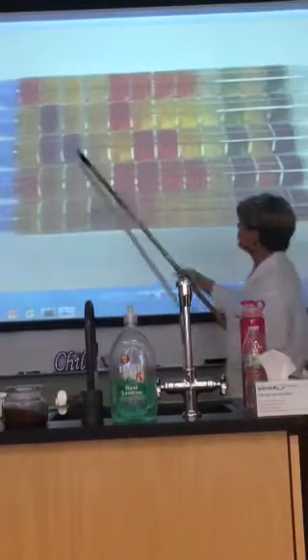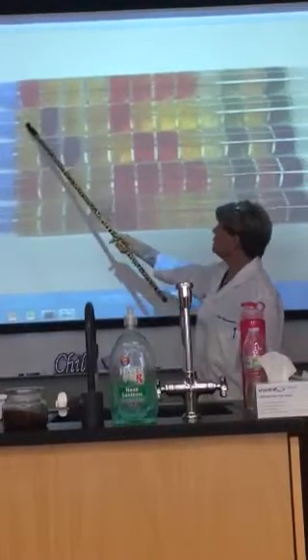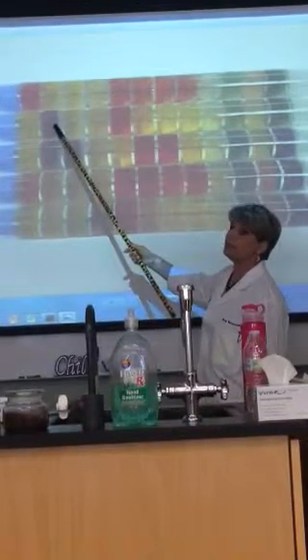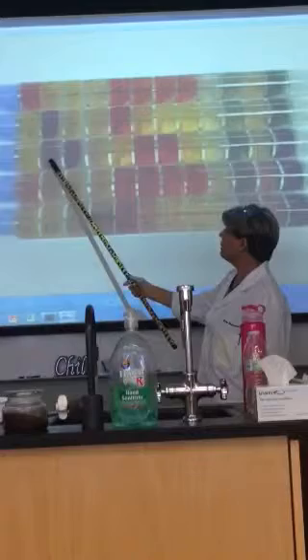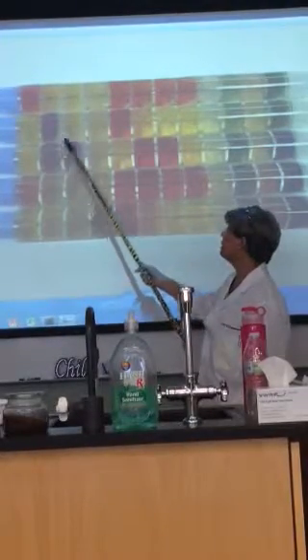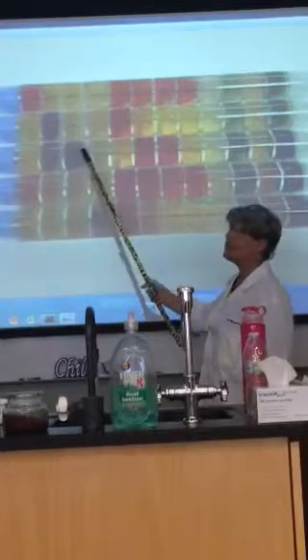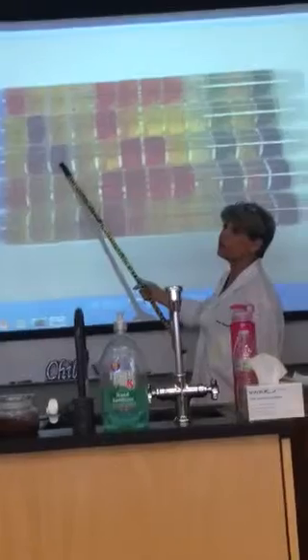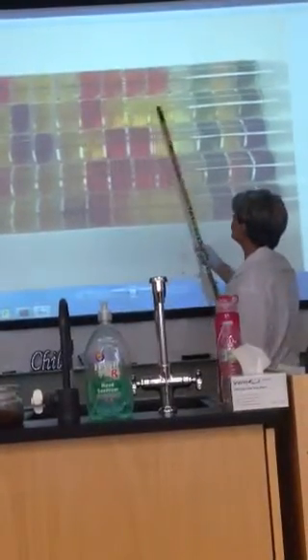All right, here's how Serratia and E. coli are different. This is glucose. They're the same. They're both glycolytic. This is lysine. Both E. coli and Serratia can ferment lysine, an amino acid. This is ornithine, another amino acid. E. coli doesn't ferment it. Serratia does. These are sugars.